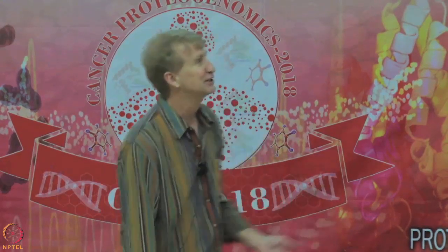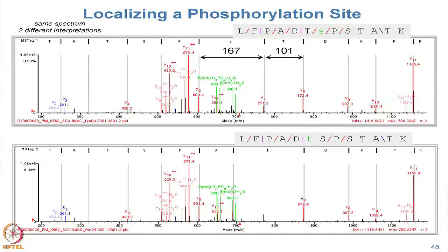Okay. All right, so the answer is yes, there's a serine. And you should have been able to vote, because you don't have to know anything to see that when you look at the labeling, there's something that's not assigned here, and it is assigned here. But let's talk about what is assigned and why.